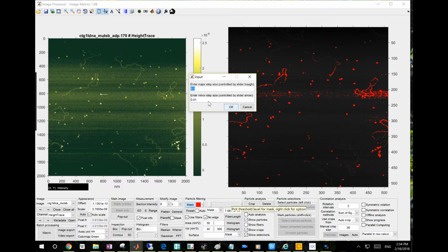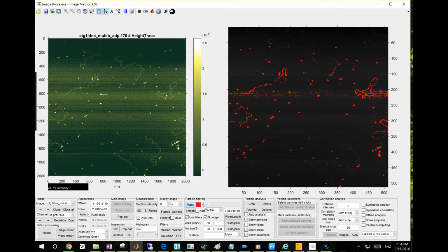So you can decide what the intervals for the adjustment are if you click arrows or if you click the empty space in the slide bar. Right now we are not going to use the mask when we do the zero order flattening. That's just to see how the image needs to be corrected. If you check the mask here, it will exclude the region in the masked area.